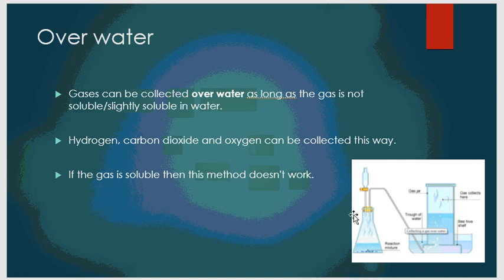Okay, so again, we have the reaction taking place. The gas is produced, goes through the tube, and then it bubbles up into this bigger beaker, and it pushes the water out, and then it fills up the inside.